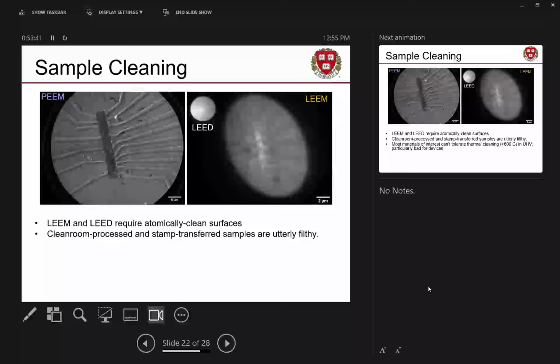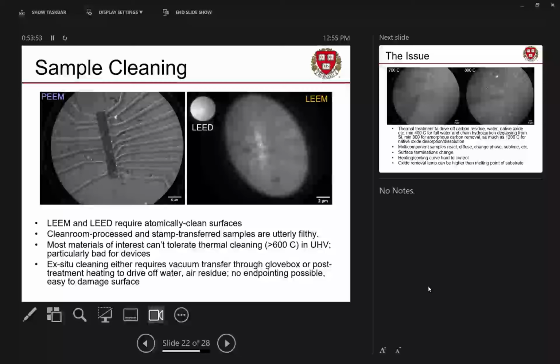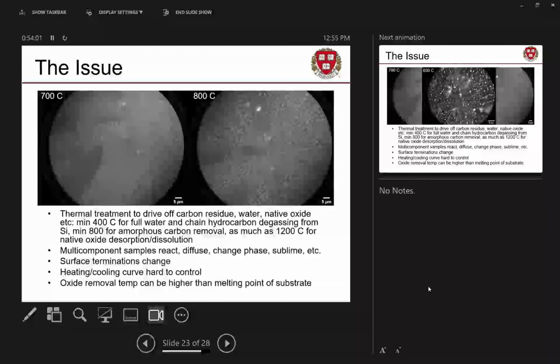Okay, so what? So fix it, right? But unfortunately, most things that we actually want to image don't like getting hot enough to boil carbon off. Carbon's pretty hard to boil. You have to go quite hot to boil carbon off of something. Unfortunately, if we actually heat a structure like this, which has different metals and different materials, it does this.